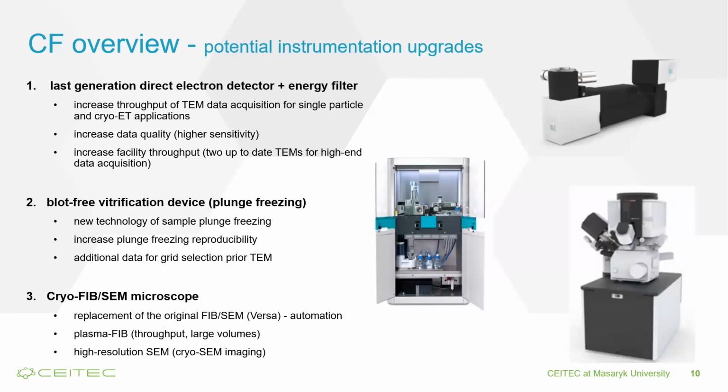So this is our wish list of the potential development of the facility that we would like to realize through the CryoEM project. And we've identified these three things as updates that we would like to deliver to our users. The first one is the update of the Talos Arctica microscope for the last generation direct electron detector and the energy filter, increasing the throughput and the quality of data coming from the technique.